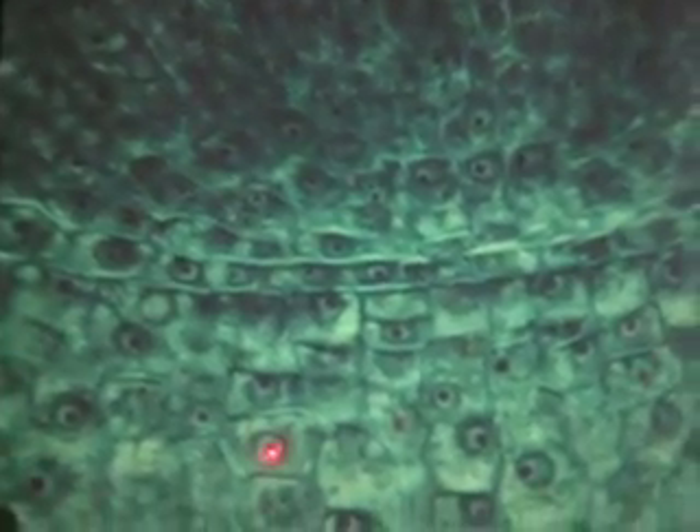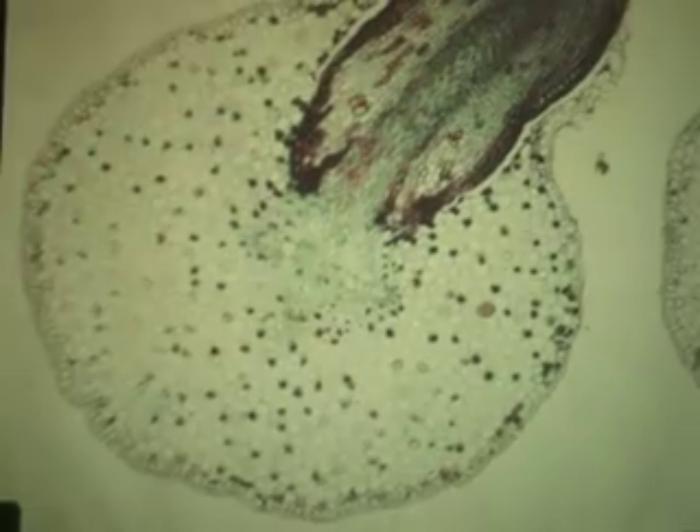See, that's one cell. That's the nucleus, and the red dot is the nucleolus. And there's the meristem area. Now if you go up a little bit higher, you notice the cells are elongated, right? You're in the zone of elongation of the root.